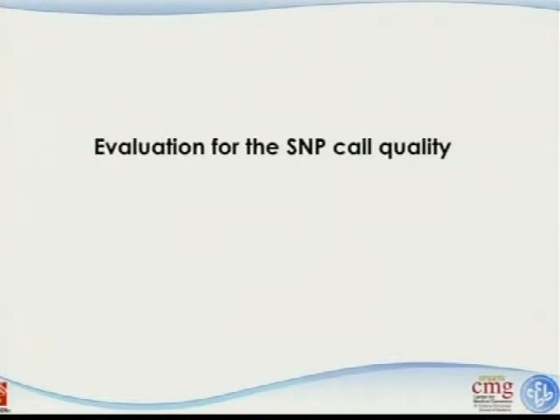So this is not a separate topic, although I listed it in this way. I just conceptually went through this variant quality recalibration. And then for the novel variants, we have some retained variants, which are good variants, and the filtered out variants, or bad variants.